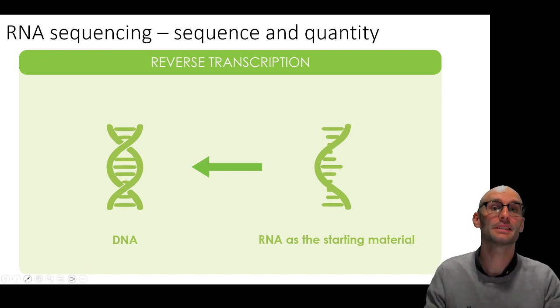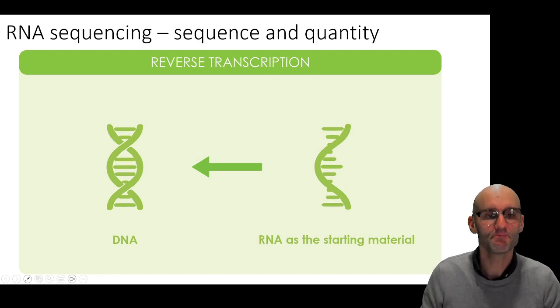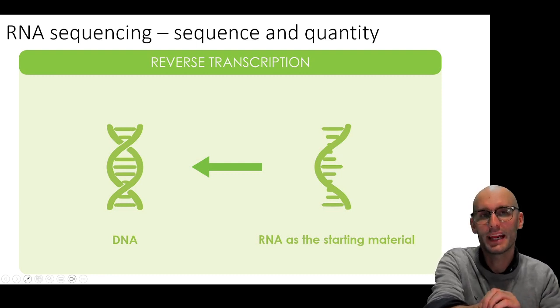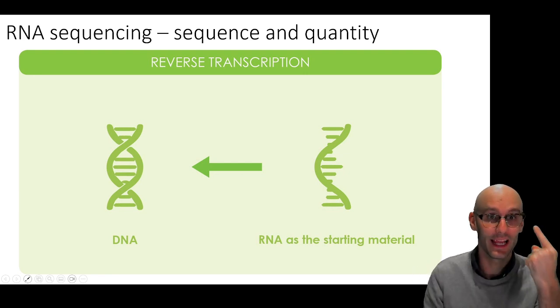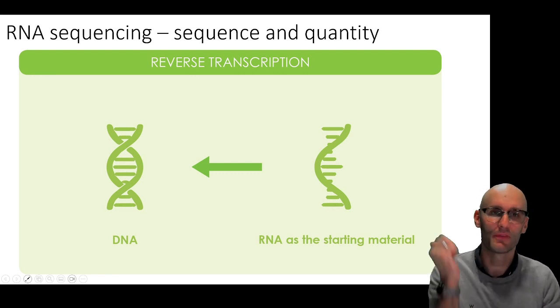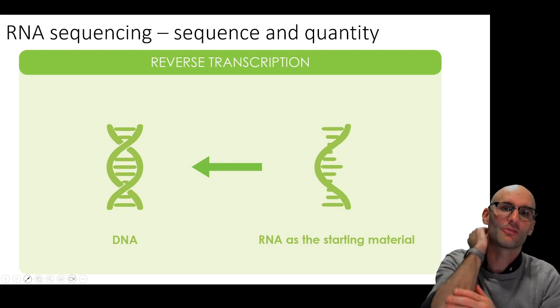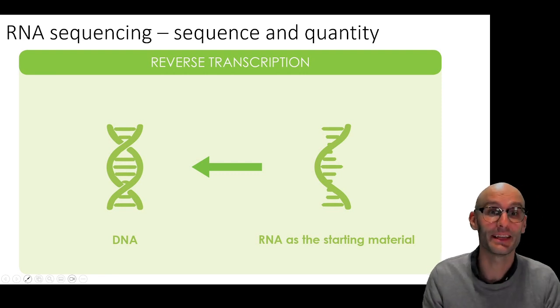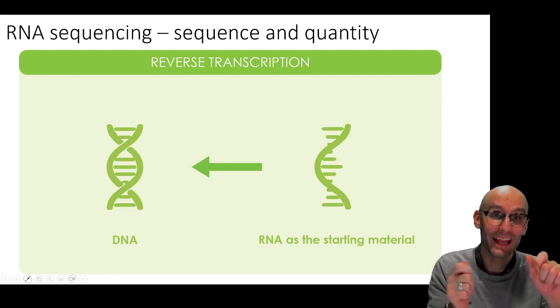Now, that's DNA sequencing. How do we do RNA sequencing? Well, we extract the RNA from the sample that we're interested in. Now, remember, RNA quantifies how turned on a gene is. Is it not turned on at all? Like keratin, the gene for keratin in my brain is not turned on at all because I do not need that skin protein in my brain. But maybe during, if I've got eczema, perhaps my keratin protein is dialed up to 11 in my skin rather than just being where it should be, sitting at a 7. So RNA quantifies how turned on each gene is.